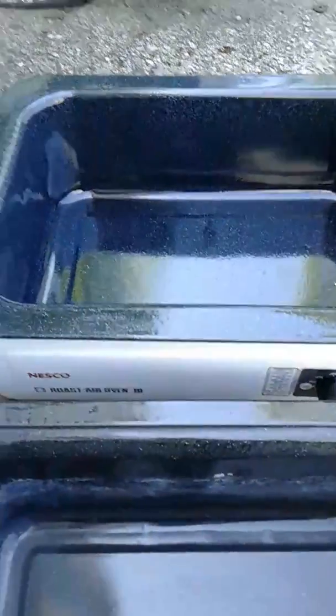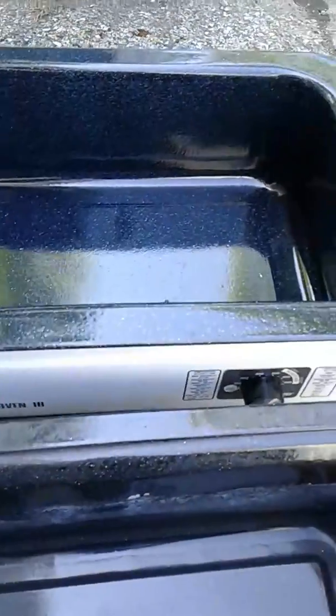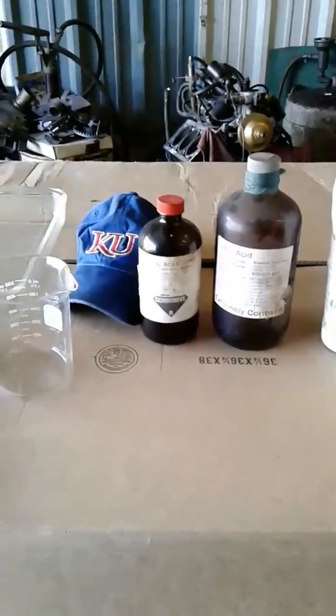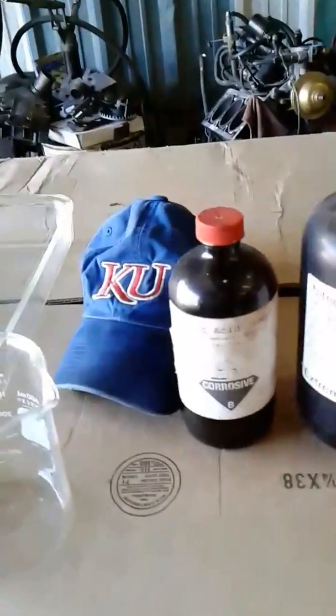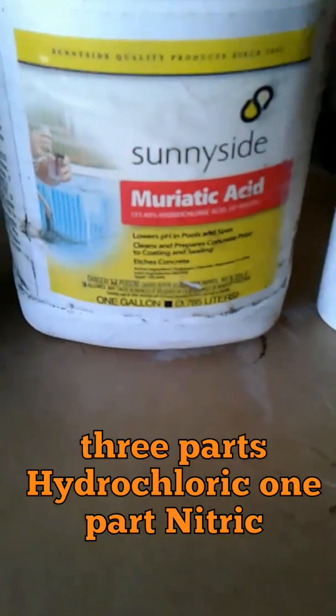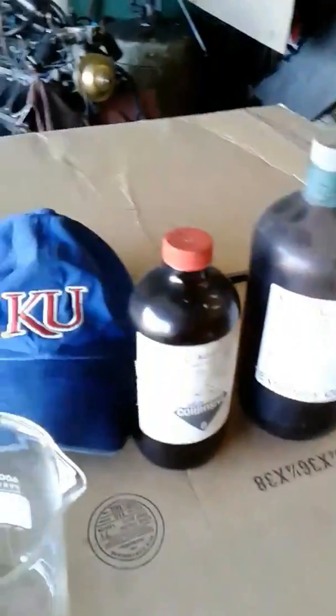My goal this time is to get the acid as hot as I can — this gets up to 450 degrees. I've run into a small snag in that I don't have quite as much nitric as I thought, so I'm going to have to use that amount to do my calculations for the muriatic acid. It's 31.45% hydrochloric acid, ten dollars for a gallon at my hardware store. Nitric is a little bit more expensive, so I'm going to have to measure it first to determine my mixture.